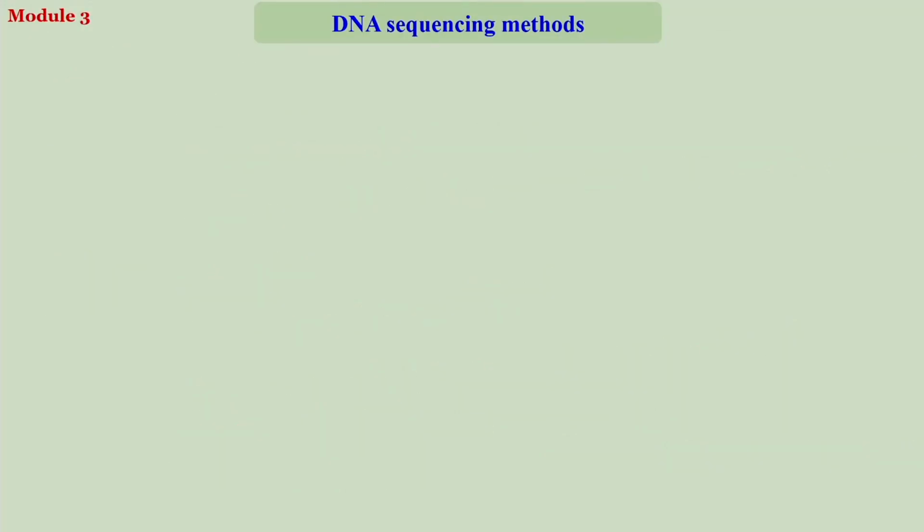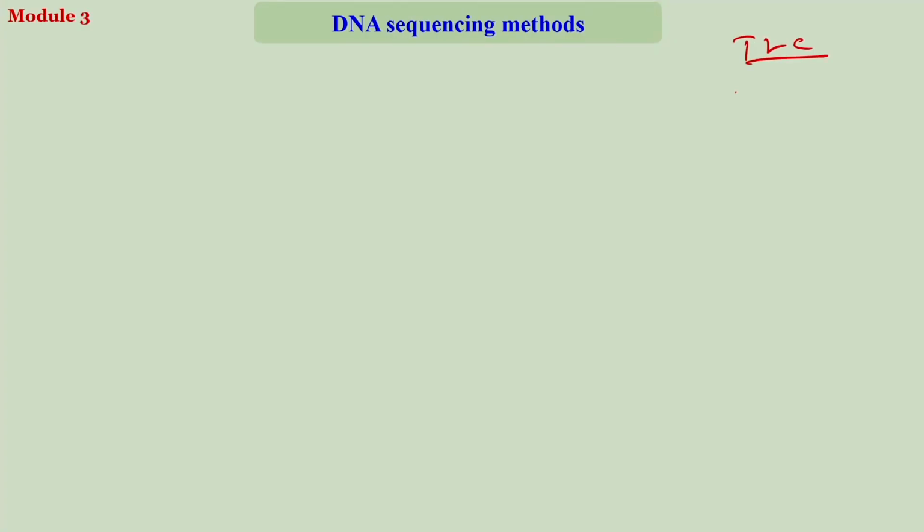It is just like doing your organic chemistry. If you remember your basic organic chemistry, we do thin layer chromatography, TLC, right, to see the mobility of compounds. If you have a plate, for example, a silica plate or an aluminum plate, and a sample which has a mixture of compounds, and you want to know how many components there are and what their polarity is.